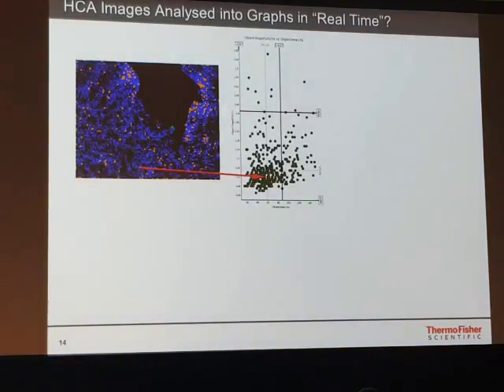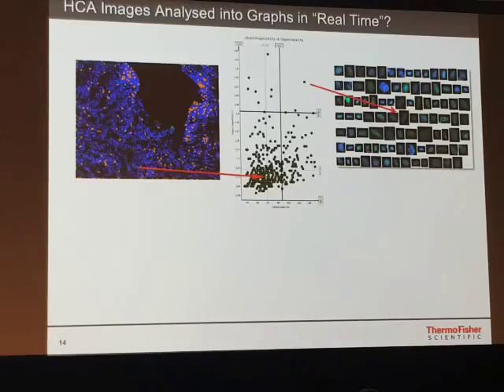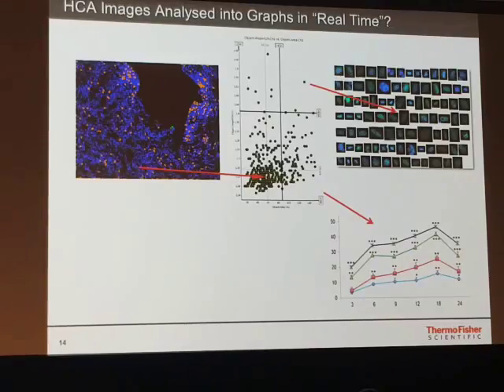And this is my almost last slide, I want to emphasize, we have now an image which can give us a similar picture, actually, as a dot plot from a flow cytometer. And the really cool part I love is that each and every single dot is a single event in a cell from the image. So from those 1,000 images, I can click on one dot and it will show me exactly the nucleus from that cell. So it tracks back to the images that are stored somewhere on the server. And with that, I can of course create a lot more significant data and reach high statistical significance.